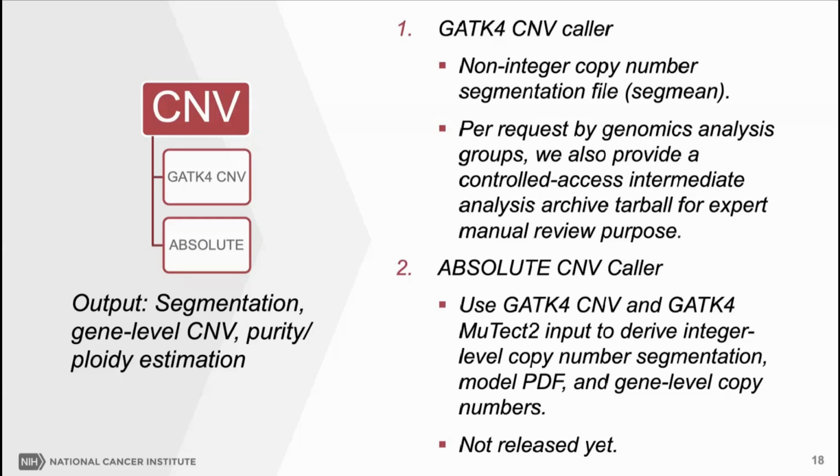Copy number inference is very complex, as the same data can be interpreted in multiple different ways. We have consulted with many copy number analysis experts in this field, and the general consensus is that automatic CNV detection can work to some degree for lots of samples.